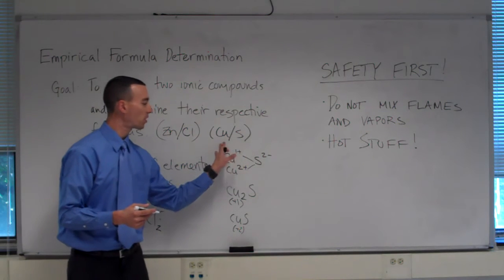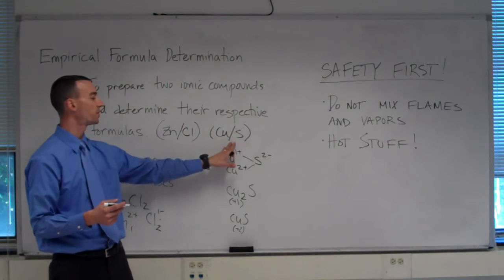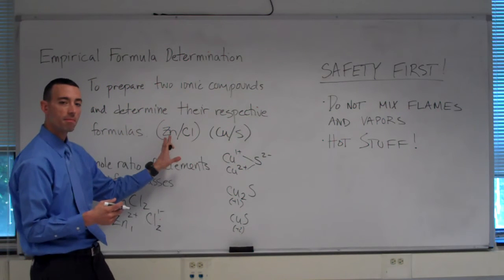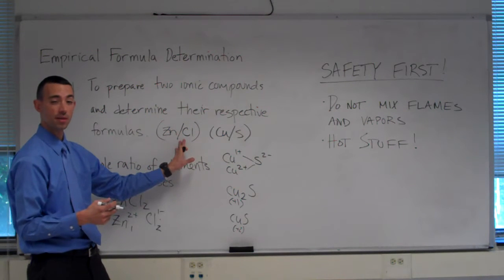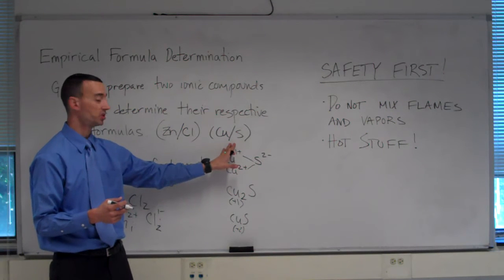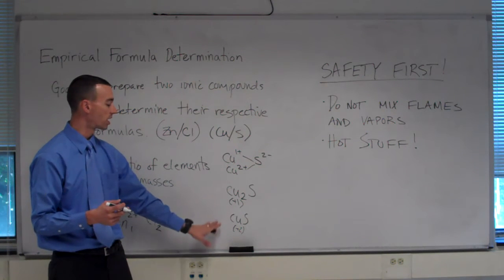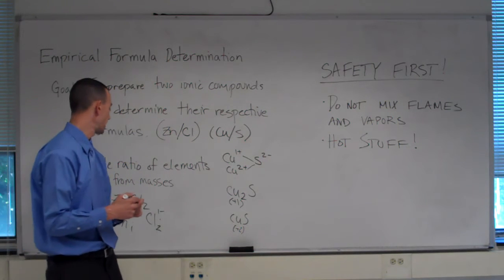So that part of the lab is a little bit more of a mystery, and the real goal is to see if you can first confirm our method is a good one for determining a known formula that we should get, and then see how well it can help us determine the formula of an unknown compound when we're not sure which one we should be getting.